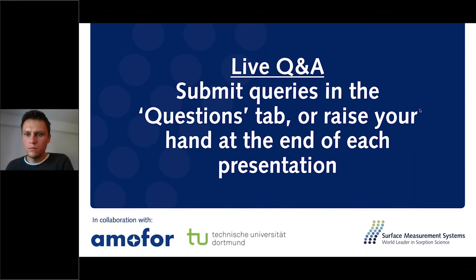Okay, I will go to the next question, and perhaps we have the possibility to unmute Ira to specify the question. How do you account for the randomness of nucleation process in prediction of shelf life?